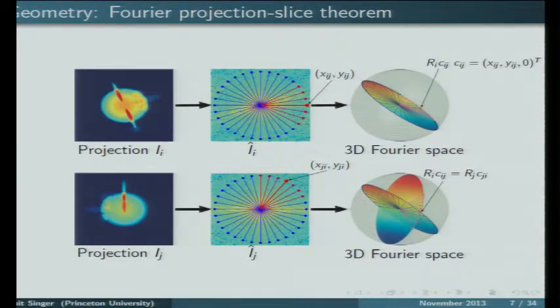What are the spokes in the 2D Fourier? Yeah, it's just what you get when you do the Fourier transform. Sorry, so it's not the colors blue and yellow that we see in the background? The background is blue and yellow, right? In the middle, there are two superimposed images, right?